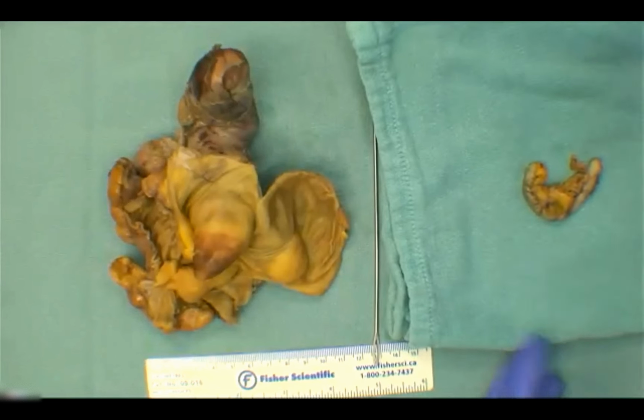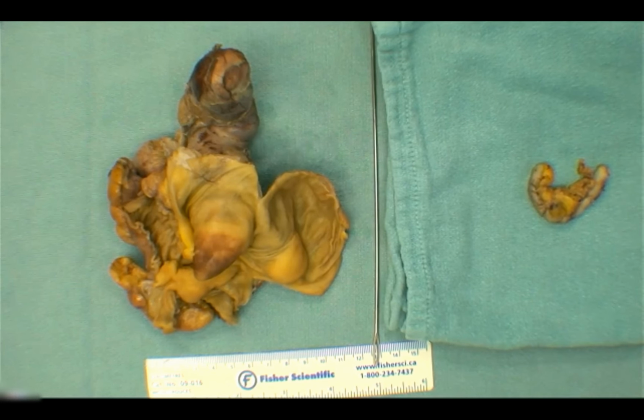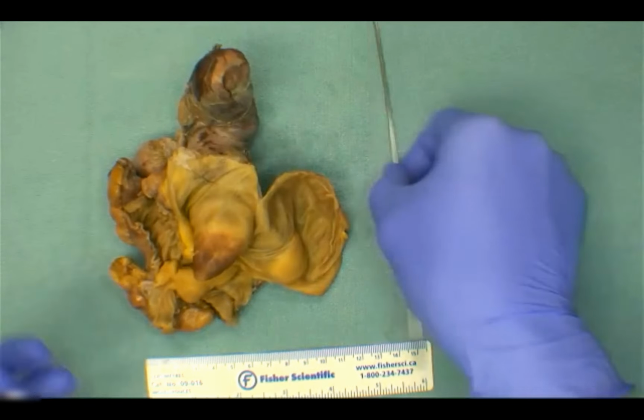Yeah, for the trainees here, you bring up a very good point. Ideally, you should only have one specimen on your bench, or at least one patient specimen on your bench, just to avoid any confusion, because these do not have names or labels on them. Once you start processing these specimens, especially if it's a multi-part specimen, you can get lost very easily. So the rule of thumb is often just keep it simple, keep it clean and organized, and ideally just one specimen per stage. So an appendectomy is exactly what we just showed you, right?